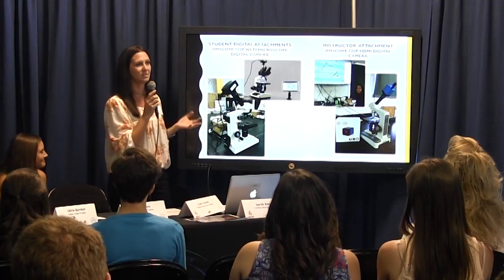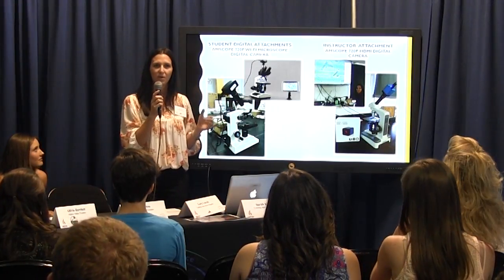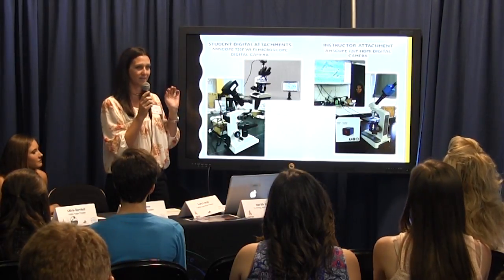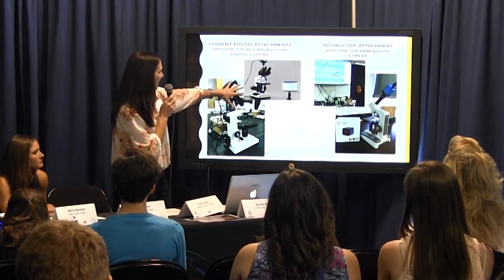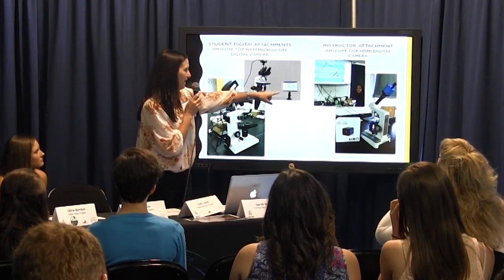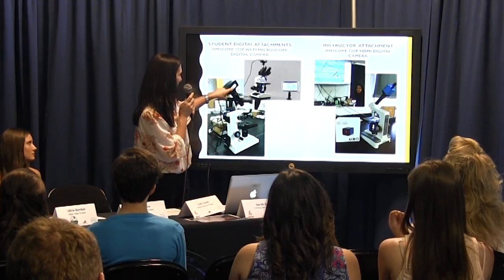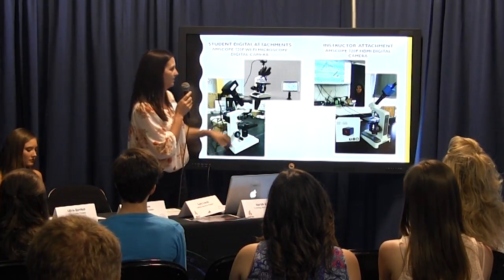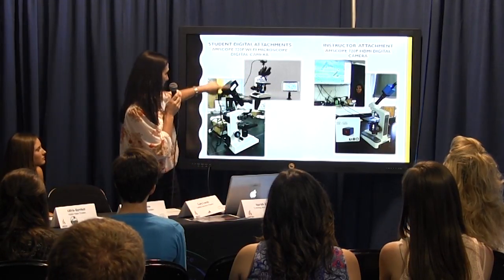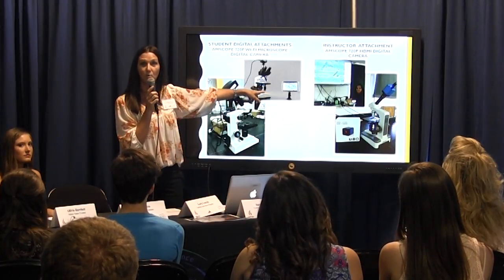And then being able to find what they're looking for and capture images. I wanted them to be able to capture images like you would find on Google Images, instead of just the prepared slides. I wanted them to master that. So I got 5 of these, and if you have mini iPads, basically they connect through Wi-Fi. You connect this to Wi-Fi, there's a little Wi-Fi code on here, and then you bring it up. They can do still images, and they can do video recording.